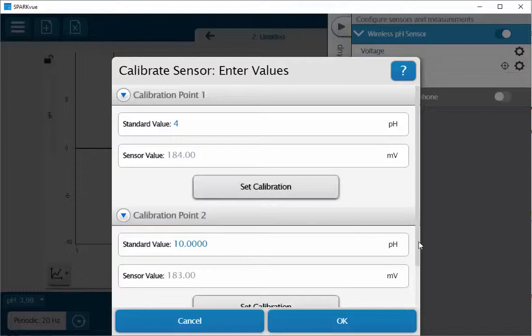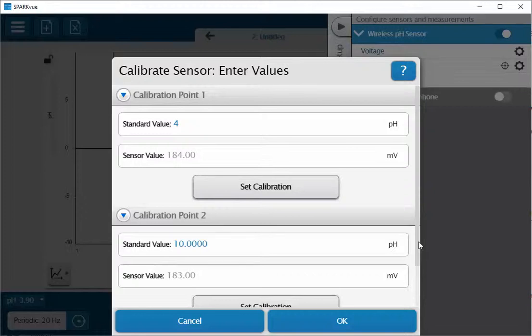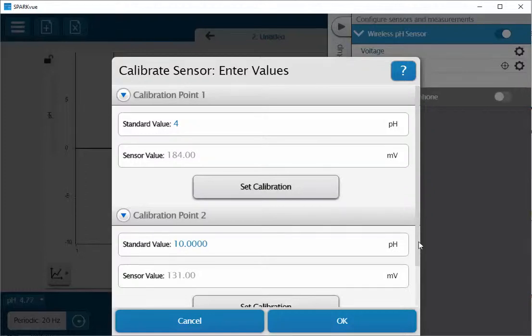Now going to remove my electrode from my buffer solution, recap the solution so that it doesn't get spilled, and then I'm going to again rinse my pH electrode and blot dry so that I don't dilute my second pH solution with the deionized water.